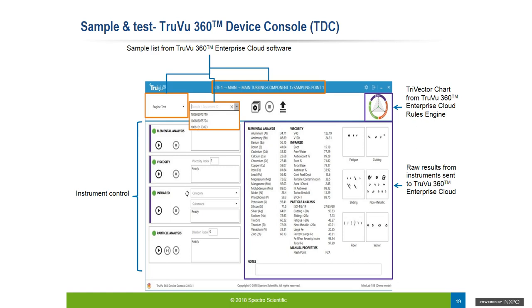Based upon the asset structure that you've set up and identified what type of component that is, for example, rotating machinery, or maybe this is a diesel generator, it will call up in that test suite which particular instruments to engage. You can, again, manually override that and launch them individually, but this way, with the selection of one button, you launch all of the test suites.